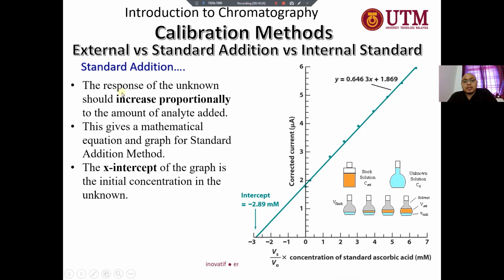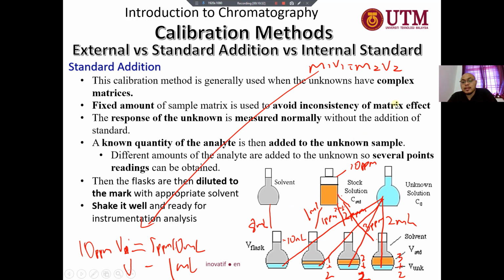Okay. The response of the unknown should increase proportionally to the amount of the analyte added. So it should be increased proportionally. Okay, again here I want to mention, I want to stress it out here.